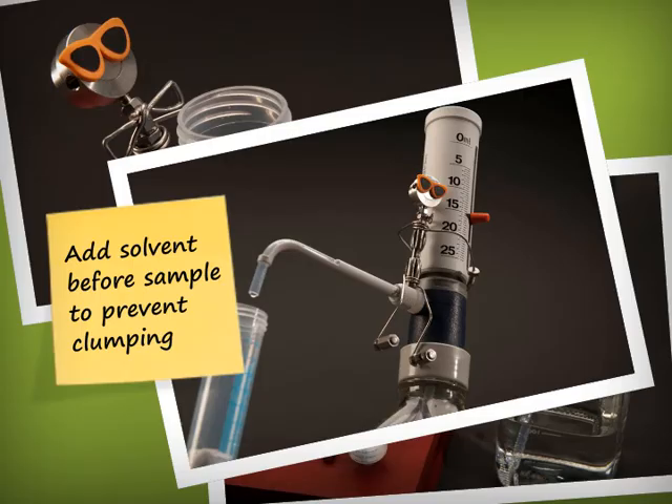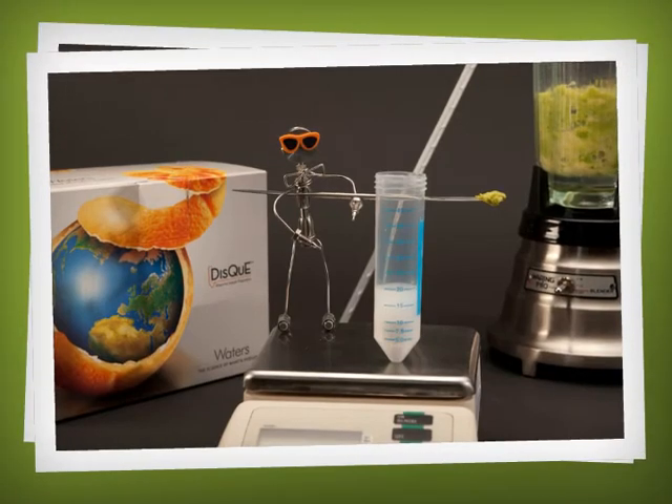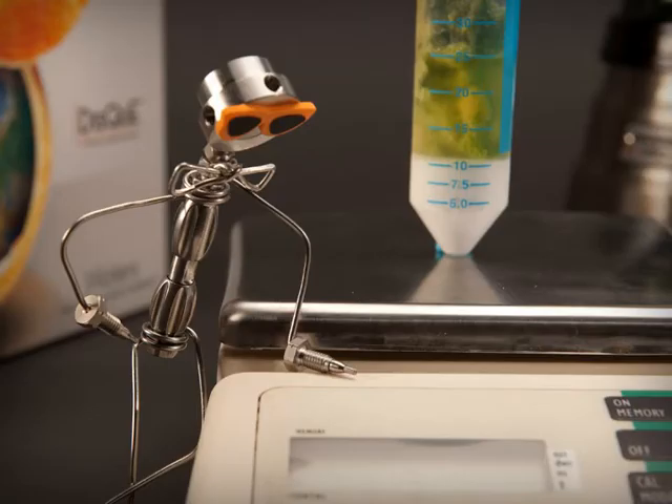Adding the solvent before the sample prevents the buffer salts from clumping, making it easier to shake. It's time to add your sample. You can adjust the amount for different analyte concentrations or sample types. 15 grams.